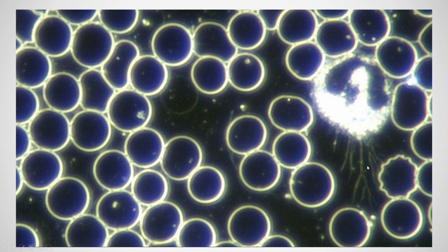It indicates stress on the immune system and something that would need to be addressed. And if it's missed, looking at the rest of the sample, if you're simply seeing bright field anomalies, you might assume that everything is completely fine. In this case, the white blood cell parasitism shows a fairly advanced stage of pleomorphic parasitism, which is usually in cases where the terrain really needs a lot of attention.